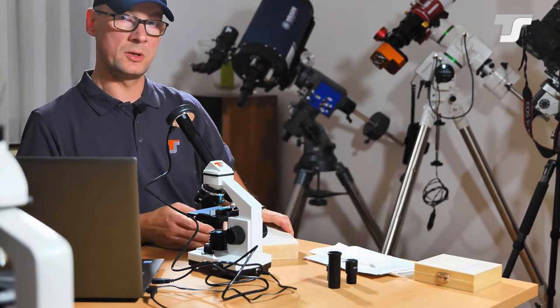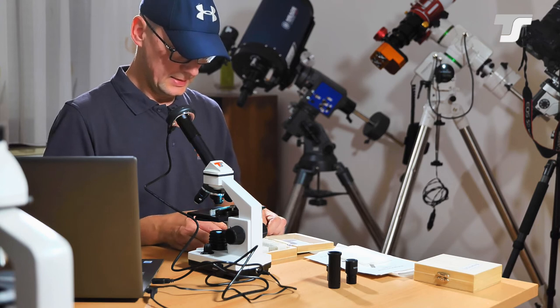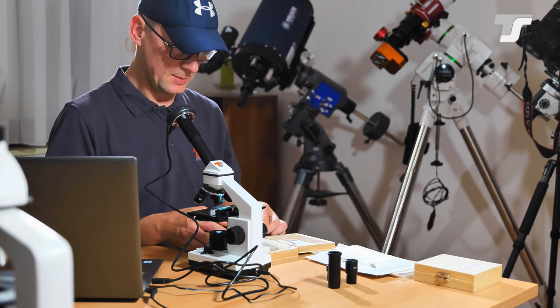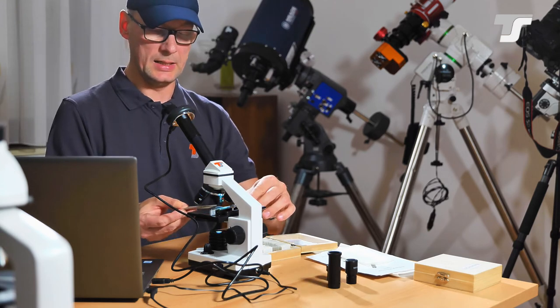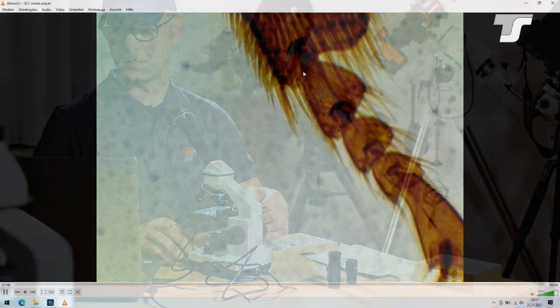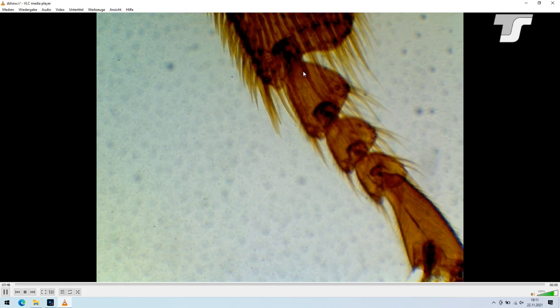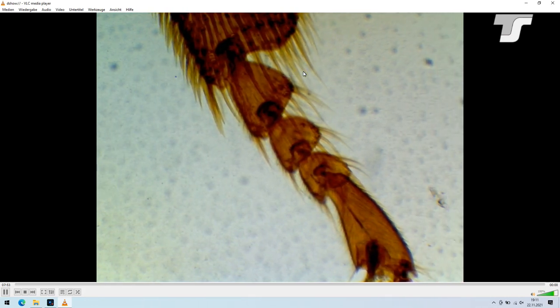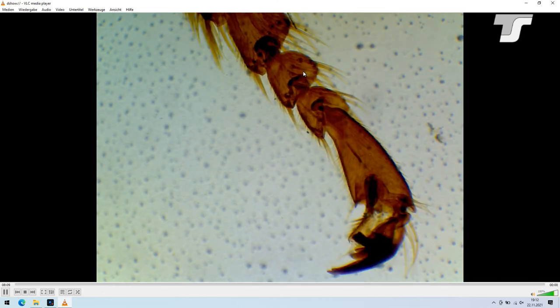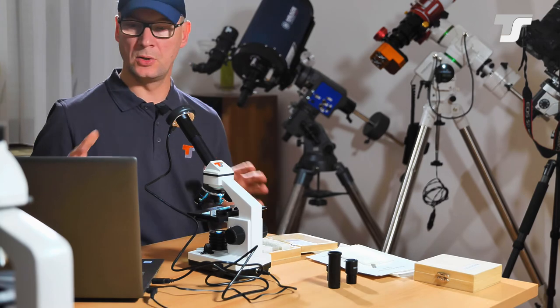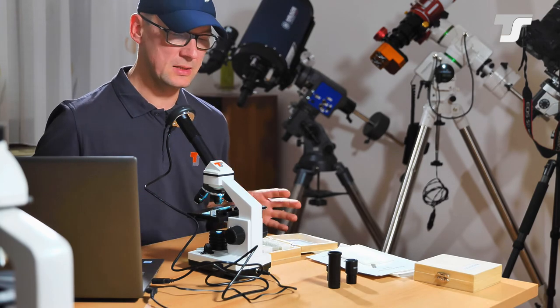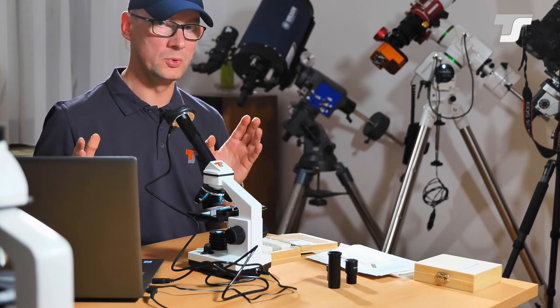So as said just a few examples. But I will also show you the Zoology. Because there are also some really incredible subjects in it. A bee-like. Not in focus yet. But just wait a second. I will frame it up a bit more properly. So this is also somewhat transparent a bit. So you can use only the transmitting light. That is possible and working very well here. As said if you have opaque samples then you should use the reflecting light. And I'm pretty sure you recognized it but it took me something around five minutes to set this all up and to get such an image here on the screen. So there is not much work to do.